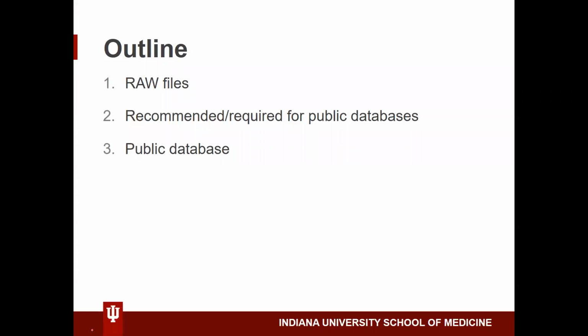So we're going to cover what a raw file is, some other types of these, what sort of files are recommended or required for public databases, and what options there are available for you to look up data from public databases. So what's a raw file, first of all?